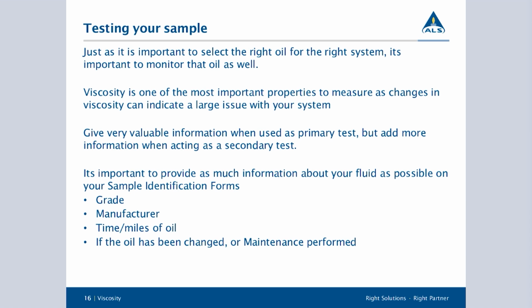So it's very important, and testing your oil can tell you so much about your system, because viscosity is one of the most important properties of oil. A viscosity change can indicate larger issues with your systems, as well as tell you that everything's operating well. Typically, if something's not operating well, you will see a change in your viscosity. One thing to keep in mind, though, is that when you are testing your oil samples, sometimes multiple issues can cover each other up. If you have soot contamination as well as fuel in your system, you will see both a decrease and an increase in your viscosity that could even themselves out.